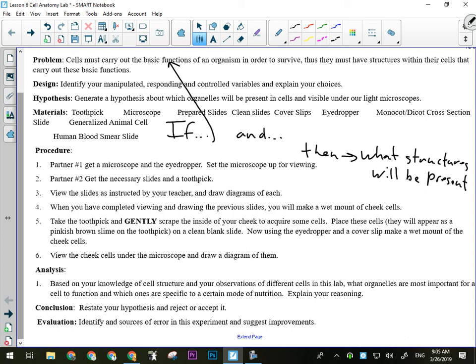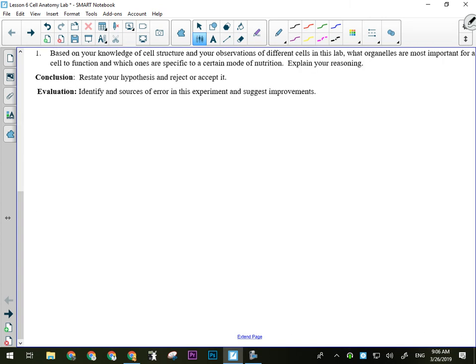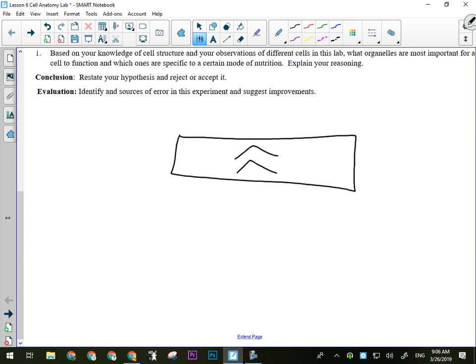Okay, so what the leaf cross section is: they've taken a leaf, and what they've done is they've cut it this way, and you're looking at it straight on along its narrowest dimension. So what you're going to see on the microscope slide is two leaves in cross section. One of those is what we call a monocot. The other is what we call a dicot. We want to look at the dicot, and it's usually the bottom one.